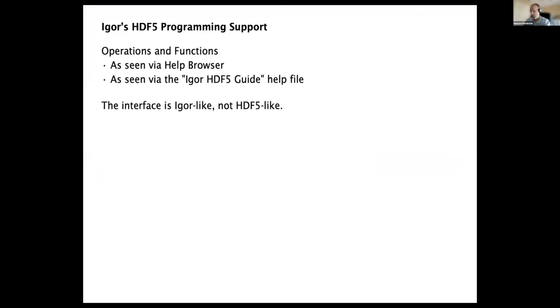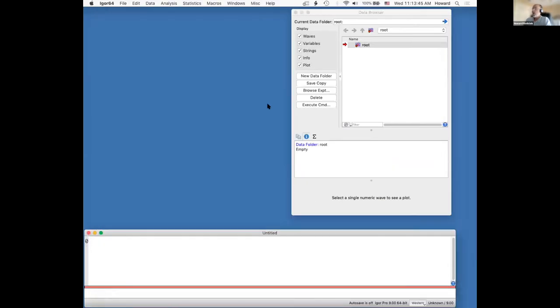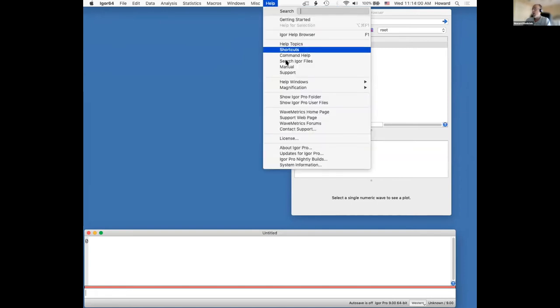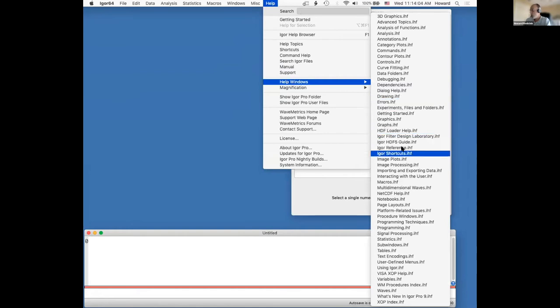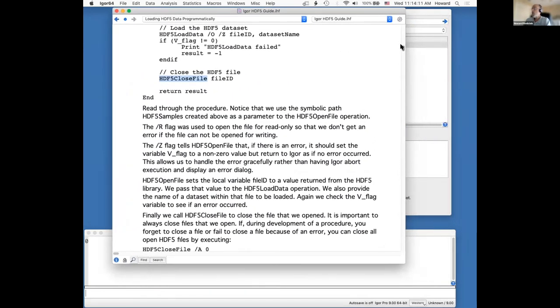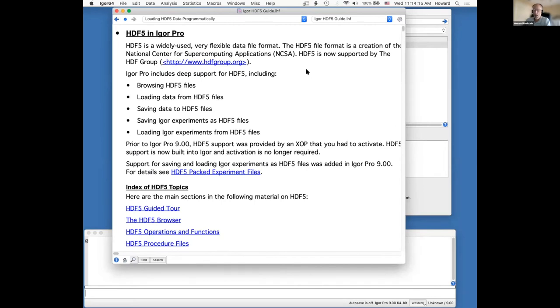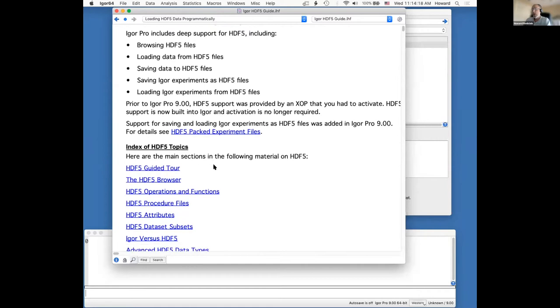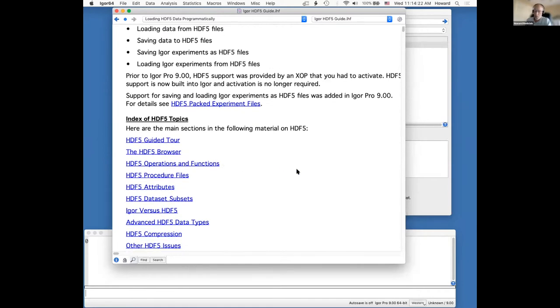Igor's HDF5 programming support: we're going to take a look at the operations and functions that Igor adds to provide control or support for HDF5 features. I'm going to go into the help menu and choose help windows, then the Igor HDF5 guide. This describes everything HDF5-related in Igor. It includes an HDF5 guided tour intended for people with pretty much no knowledge of either HDF5 or Igor — even someone just considering using Igor could feel comfortable with it.